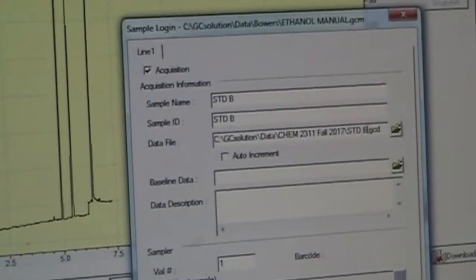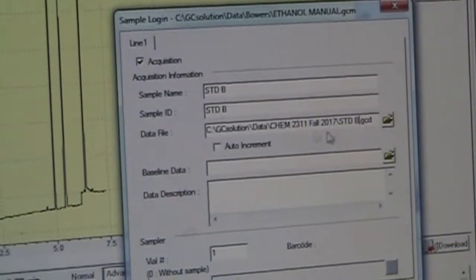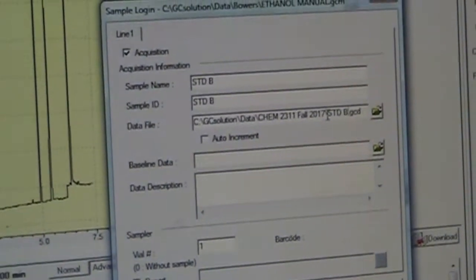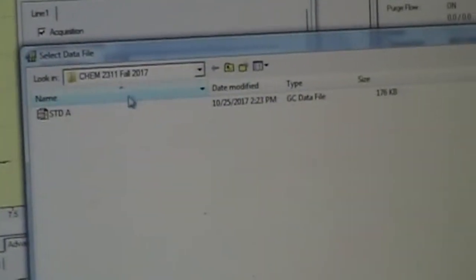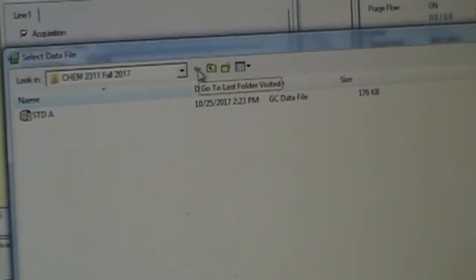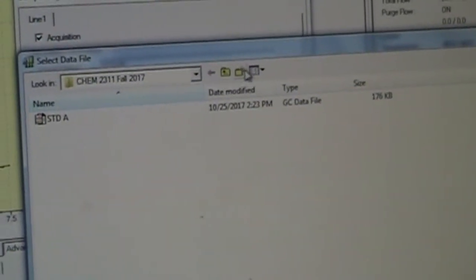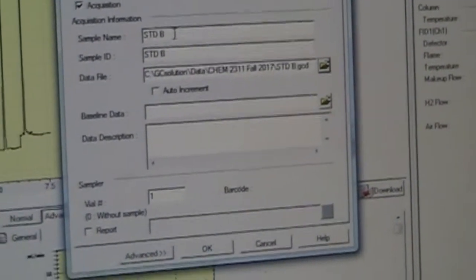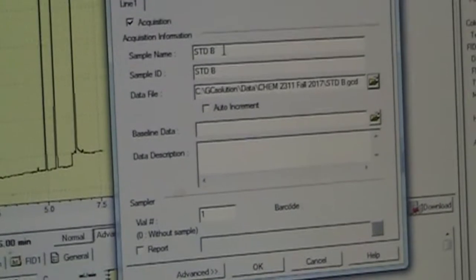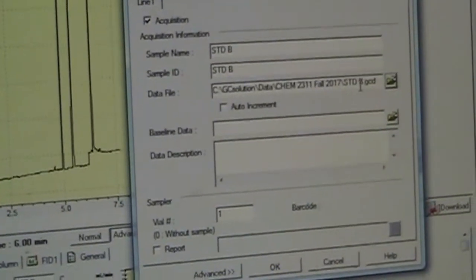So there will be a CHEM2311 folder for the appropriate semester. If you aren't in that folder, you can navigate to that. You can always click on the folder button and find your way around the tree. CHEM2311, in this case Fall 2017, is where I want to, and I'm just going to name the Standard A as the file name.